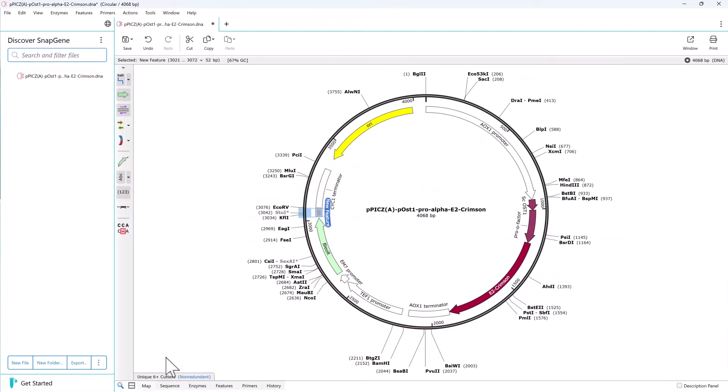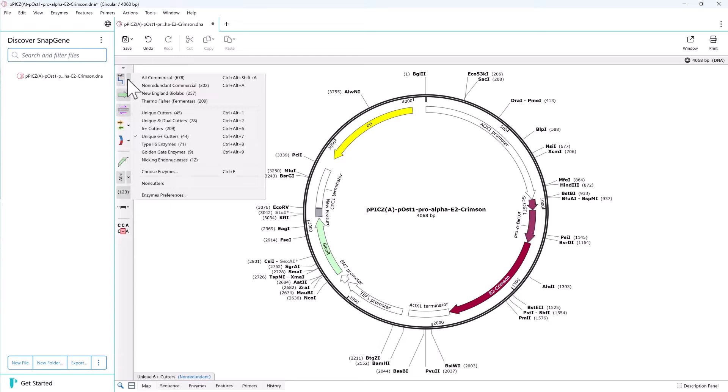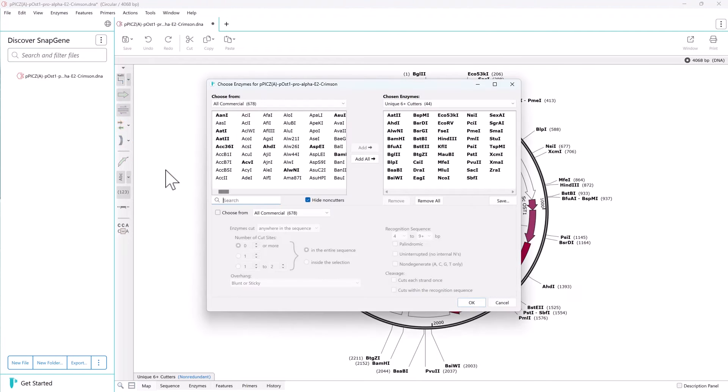You can easily choose what enzymes to display on a sequence and save custom enzyme sets.